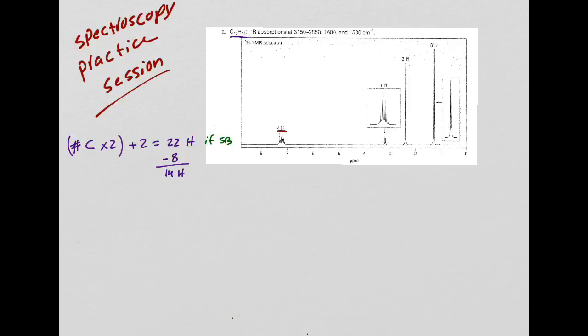Okay. Now, the other piece of information that I really like when I look at this, I go, oh, there is no oxygen, there is no nitrogen. Okay, so this is good. I've already got a lot of information out of it just by looking at the formula. Then they give you the IR absorption. These are the peaks they see on IR. And they give us hydrogen NMR. So let's go over the proton NMR and then see what we can get out of it.